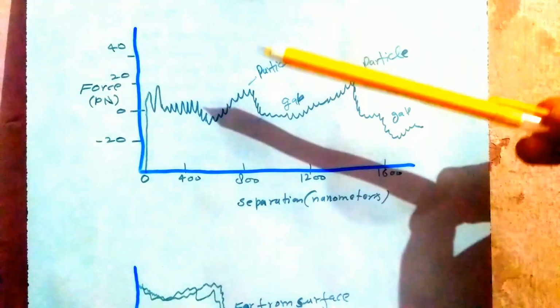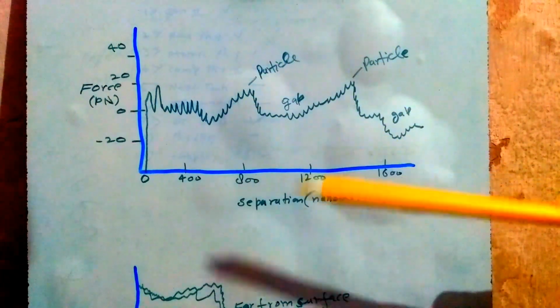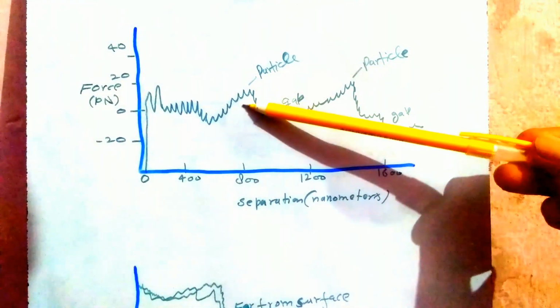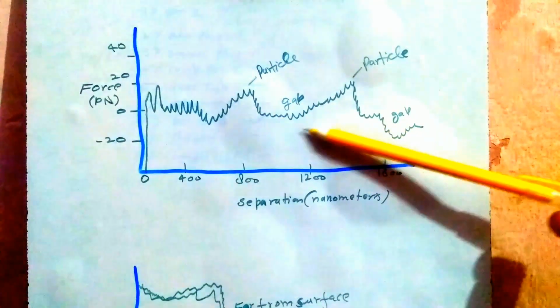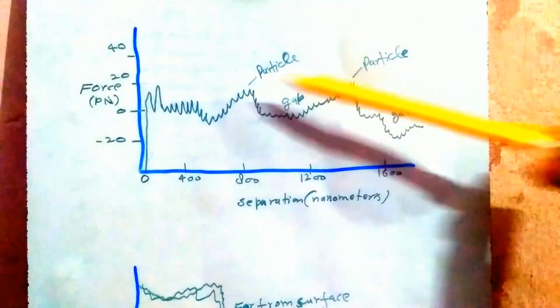That means there was repulsion when the probe was on top of the surface. There was an atom, and due to the Coulombic force of repulsion, the probe was repelled, and the force peak is seen here. And as the probe moves on, there is a gap again. Then there is another peak observed. So the peaks are here.